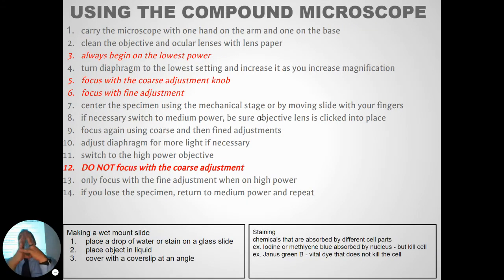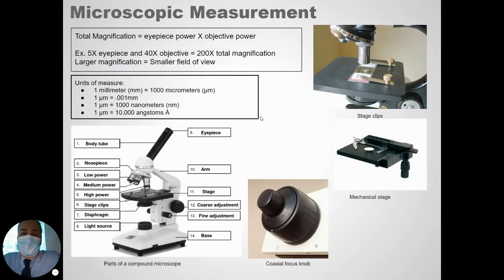Some of the things we look at in the microscope don't have any color to them. They're kind of transparent. In that case, we often might stain a specimen, which is using a special chemical that the cell or the specimen will take up, and it allows things to stand out more, and you could see them more clearly. Some stains, for example, will stain the nucleus of a cell darker, so you could look at the nucleus. Others might stain the cell wall different colors. So we might use stains to help us see things more clearly.